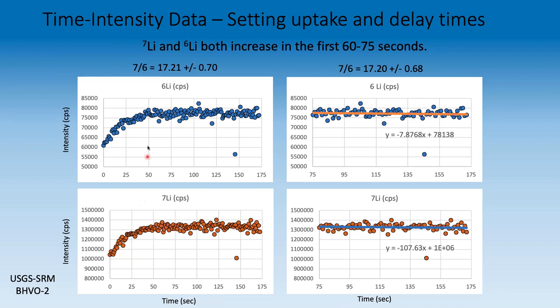But that uptake, if we look at the ratio of 7/6, even for this one over here, and this one at 50 seconds over the other one at 50 seconds, this one nearly at 150 seconds, and this one also, something weird happened. I used to have a service engineer say, oh, you swallowed a nugget, or we didn't swallow a nugget. But we've all had those times where for some reason intensity just dropped and then it comes back, or a sample didn't work. Well, this is one point where it didn't work, but it did.